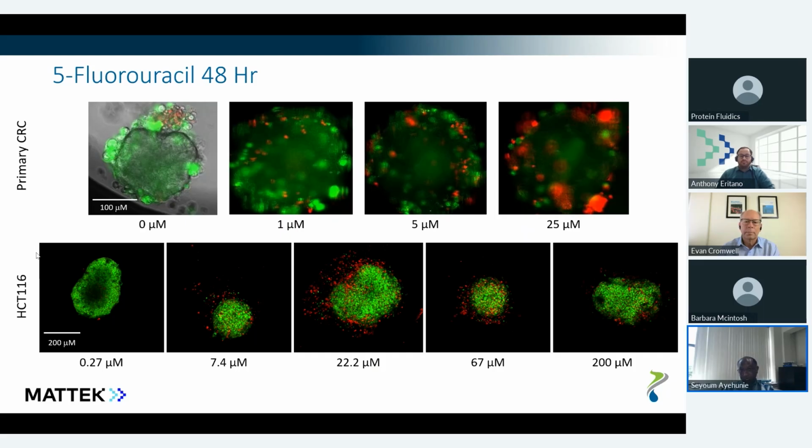So whatever you are, here, for example, if you are estimating drug responses based on the standard cell line, HCT116, you can take it over 200 micromolar, and you can model it for the human consumption, and then what it means is it could be more toxic to human, and the side effects could be higher. And what it means is there will be drug attrition by the patients. Next slide, please.